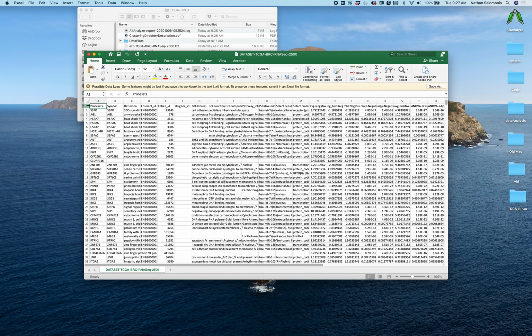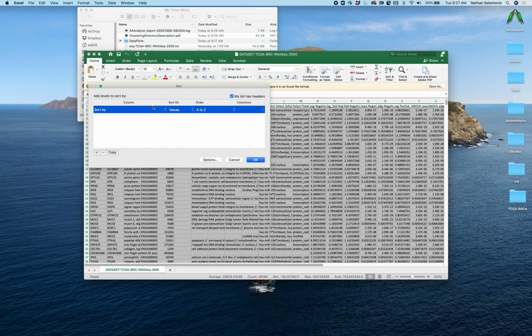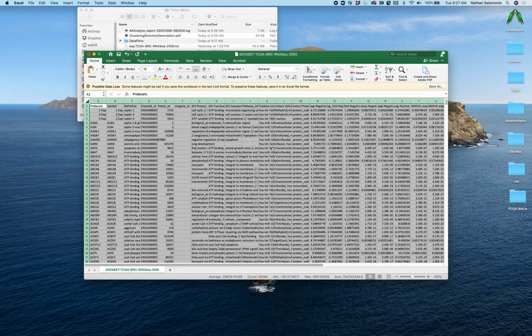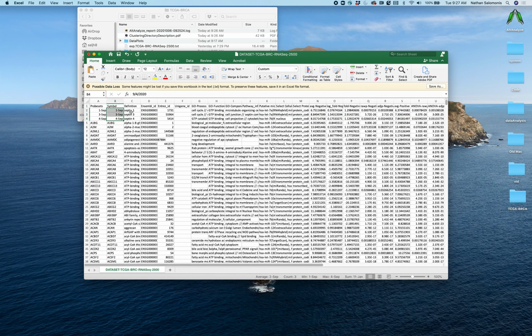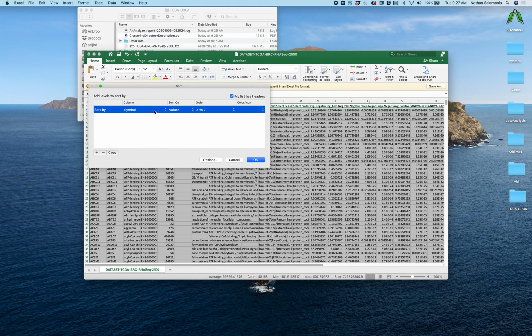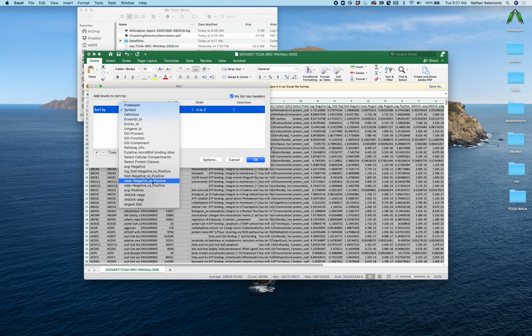This is usually not recommended, because if you do this and you now sort by gene symbol, you'll see that the genes at the top are actually gene symbols that are originally called SEPT1, SEPT3, SEPT4, for example, and their gene symbols have now been replaced by these dates, which Excel does automatically. You can get around that by opening the file from Excel and choosing to import this column or these columns as text rather than as automatically determined fields. In this case, however, we're going to resort this file, and there's a number of statistics and annotations in this file that we would want to look at.